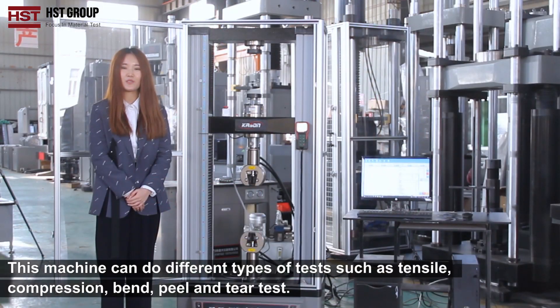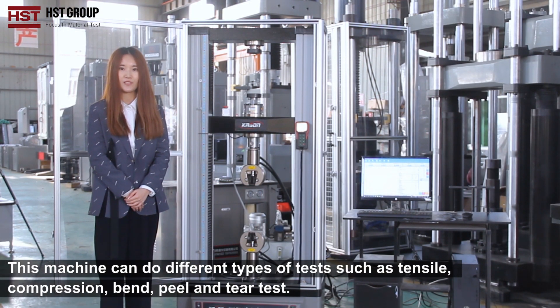This machine can do different types of tests such as tensile, compression, bend, peel and tear test.